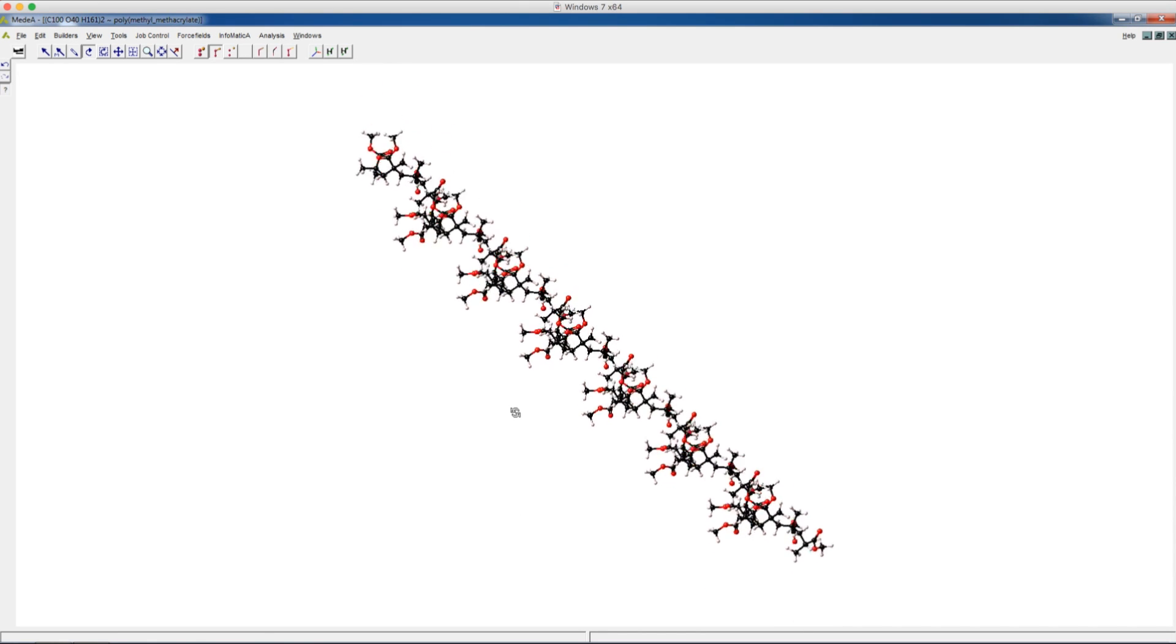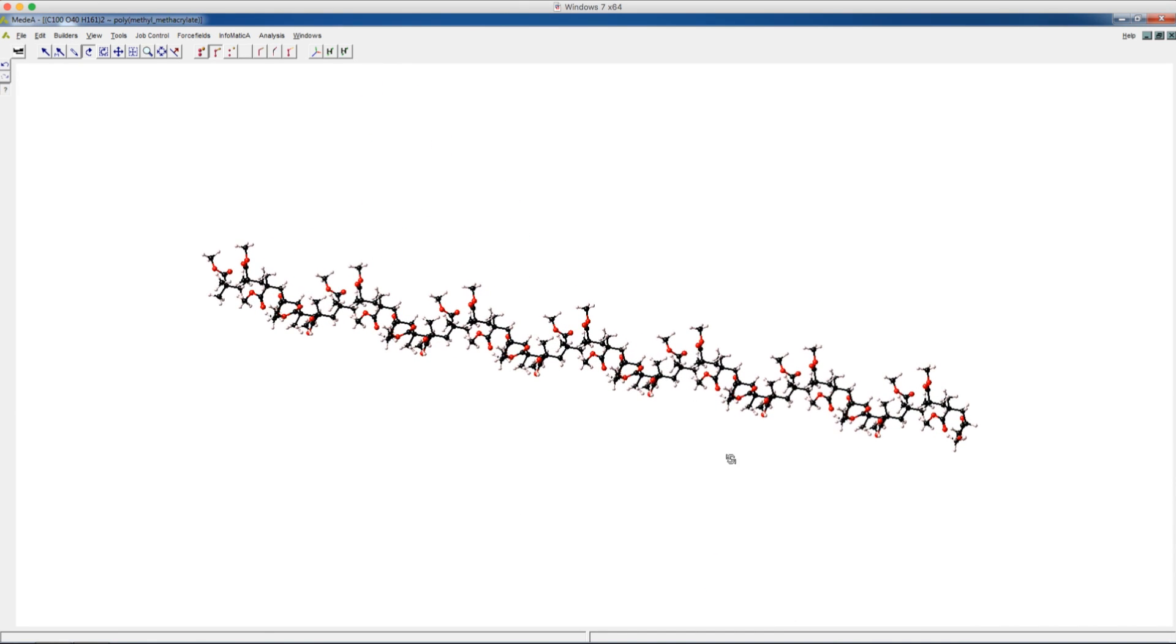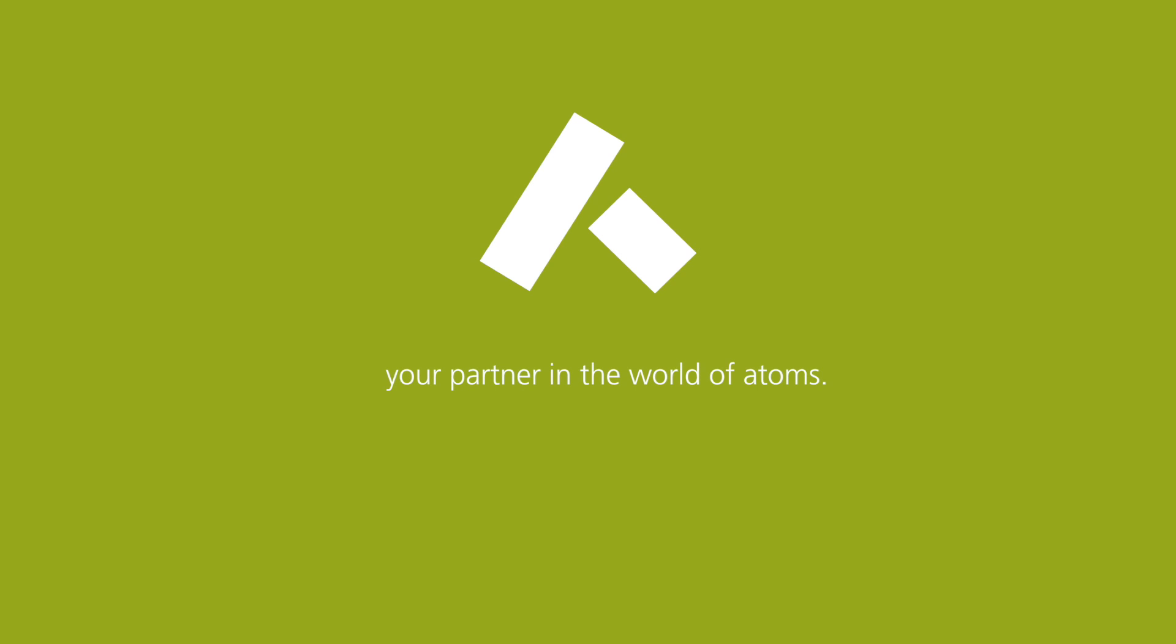Here are the polymethyl methacrylate chains that we just made. Thank you.